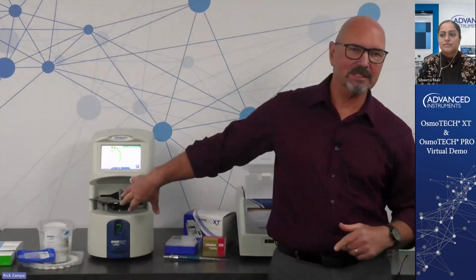Well, this is the OsmoTECH Pro. It's not used in the clinical environment, but if you were to use the multi-sample instrument for the clinical environment, you would load 2 samples and run them in duplicate back to back, just like you would do on a single sample instrument. And that's another thing to point out.